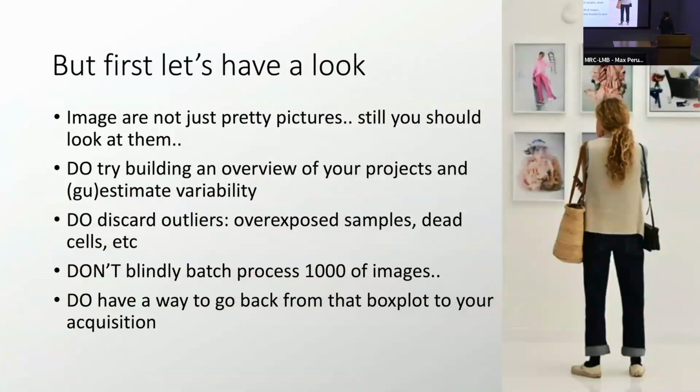But just before scaling it up, we often need to step back a bit. This is a huge piece of advice I learned over the years: they are not just pretty pictures, and we want to have numbers out of them. We want to quantify things, but we still have to look at them to get an idea of the data set.